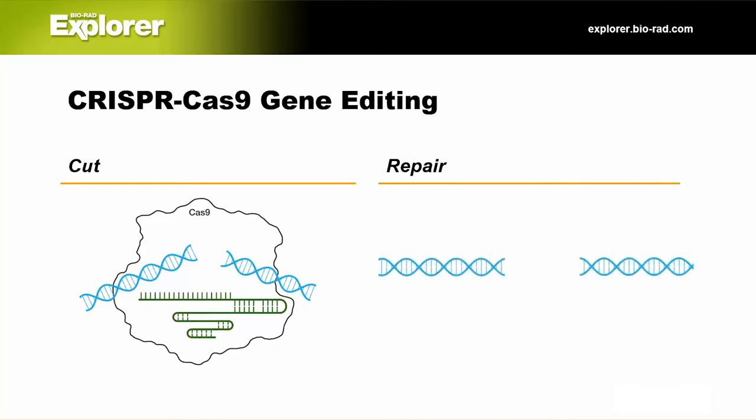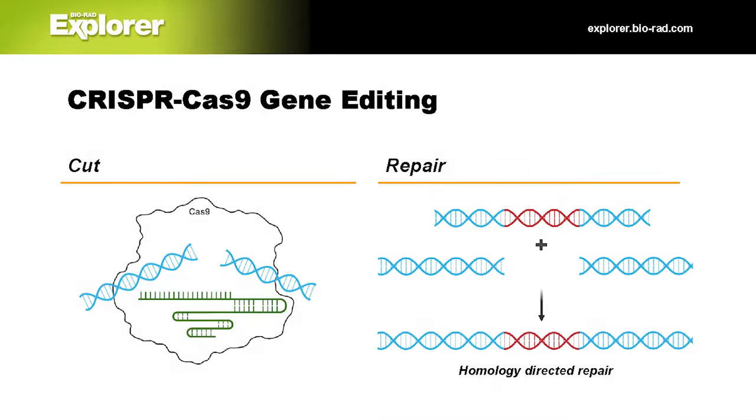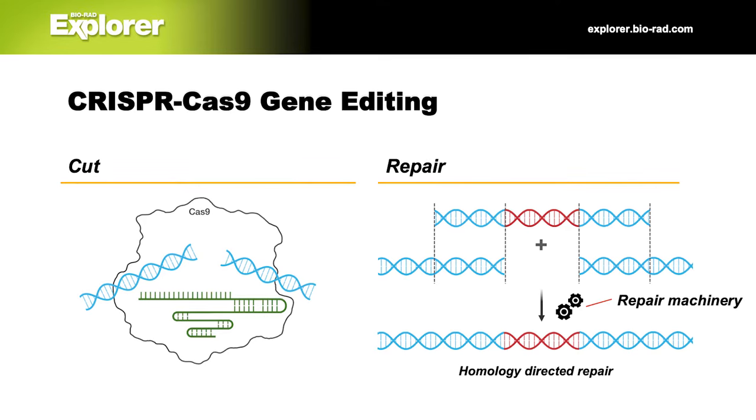Here we have our target DNA, which has been cut. Bacteria can use a process called homology-directed repair to fix the double-stranded break. In this process, donor DNA is patched into the cut using bacterial repair machinery. The donor DNA has what are called homology arms, which are sequences that match parts of the destination DNA. The homology arms help the donor line up correctly.